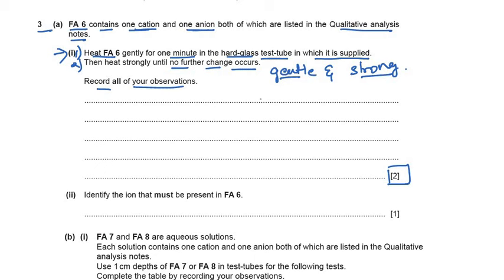I'll just tell you that on gentle heating there was no particular observation, but we can see minute fumes. If the fumes are colorless, we can just write that a colorless gas is produced. So this is the observation which we will write: colorless gas produced. Now, if this is a colorless gas, it might be ammonia or some other gas like hydrogen, and carbon dioxide will produce bubbles. But let's go ahead and say this colorless gas is tested in different ways.